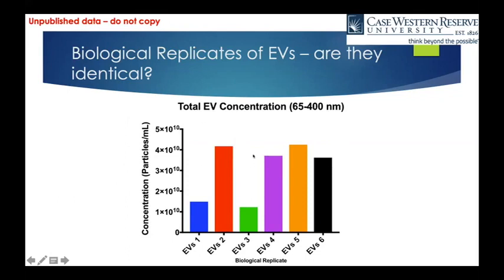So given that we do have an instrument to figure out the concentration, we are able to then go forward with our biological activity assays in cells and normalize our input of extracellular vesicles between our different preparations. But that's not really the end of the story.